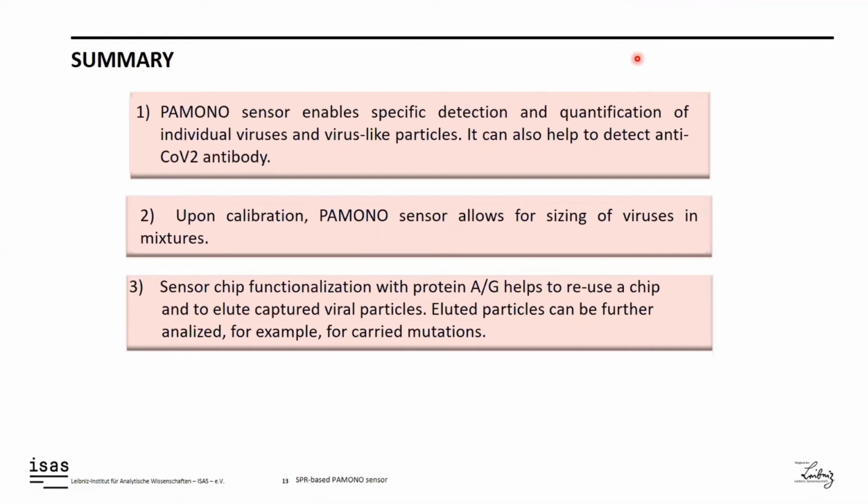Upon calibration, PAMONO-sensor helps to size viruses and other biological nanoparticles. Moreover, functionalization with protein AG permits to elute captured viral particles and perform their further analysis.